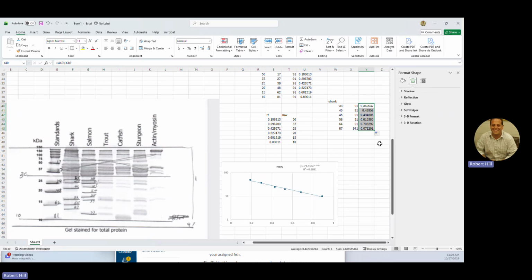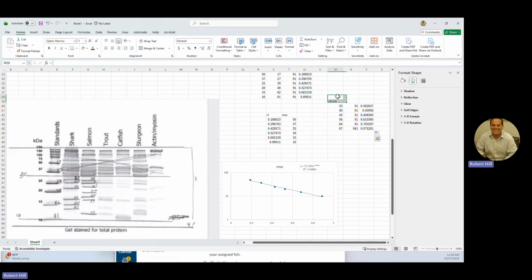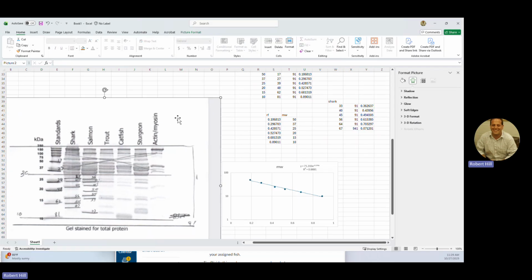Okay. And you can use Excel to work with that formula as well. I'm not going to tell you guys how to do that. I want you guys to figure that one out. All right. You don't have to use Excel to do that. You can use your calculator. But I will tell you that since you're doing, remember this was exponential. Okay. You have to use the natural log function to calculate it. Right? So you're just taking this value here, plugging it into this formula for X, and solving for Y. But in order to do that, E to that on your calculator, use the natural log, which is the LN button on your calculator. Okay. You can also use Excel to do that. I'm not going to show you how to do that. You can look that up. Okay. All right.